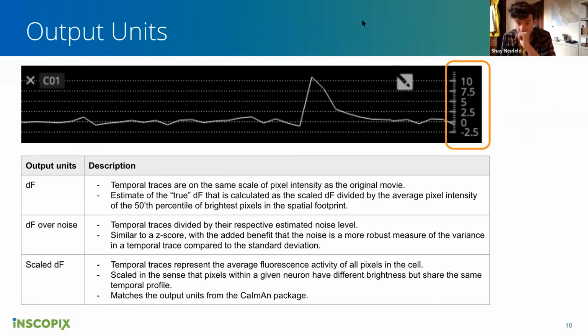That's a great question. So the answer is that it's not. When you say crop the movie here, I'm assuming you mean in time. So you're saying, I just want to crop it to exactly when the stimulus happens. Yeah, like the plus or minus 1 minute. I would really differentiate trying to estimate the activity of the neuron from trying to compare across a stimulus, because the more information CNMFE has, the more time points it has for the pixels, the better it's going to be at estimating where that neuron was and what activity it had over time.